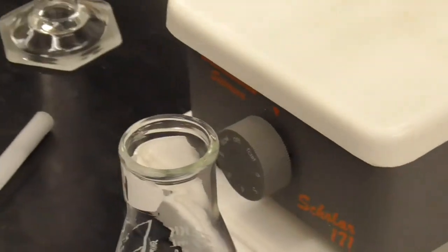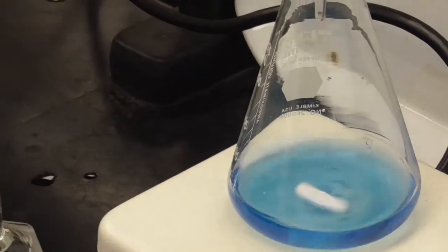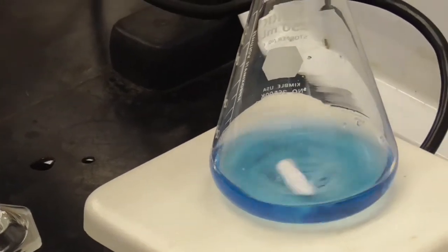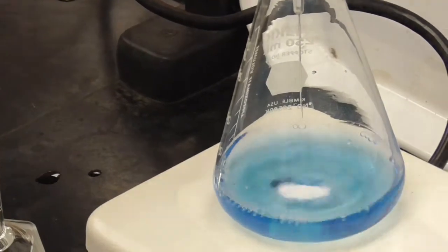And again, Dr. Dene has the solution ready to go. He's going to put that under the burette, and he'll get that started. So this is trial number 4, at room temperature or whatever temperature it was. These are still at the original temperature that you saw at the early part of this video. So he's got this started, and again, I'm going to pause this while we titrate so you don't have to watch however much it is.